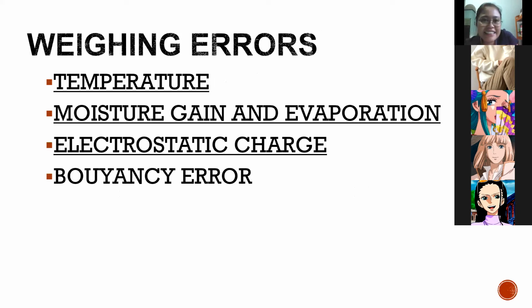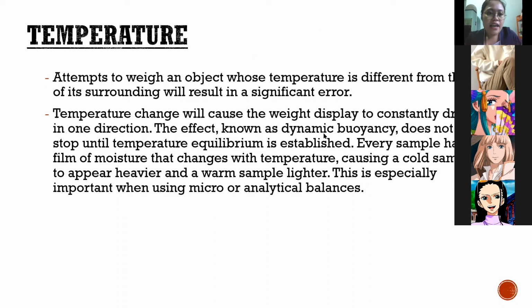Okay, let's talk about the weighing errors. These are the sources of our errors, the reasons why we get weighing errors. So we have the temperature, the moisture gain and evaporation, the electrostatic charge, and buoyancy error.